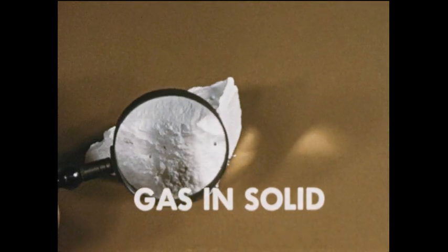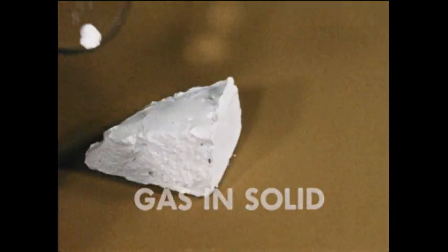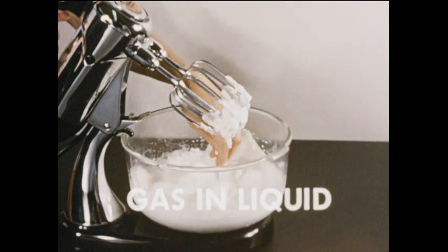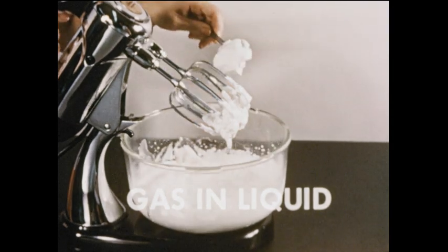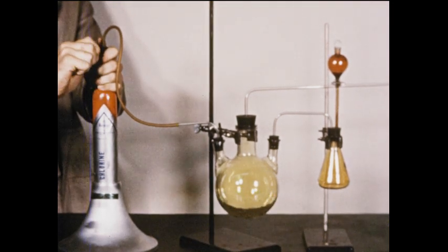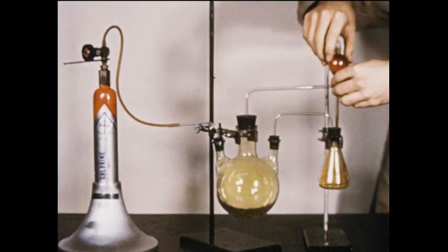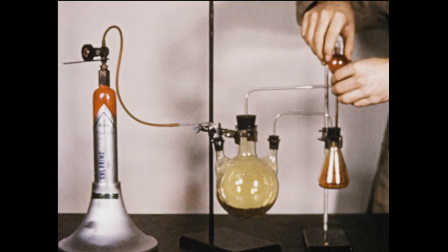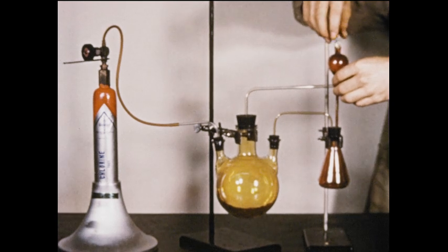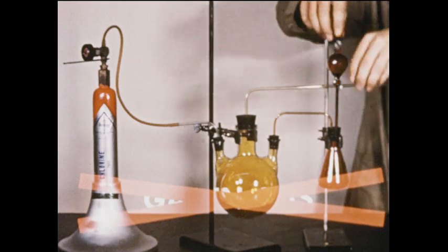Plaster of Paris is a gas, air, dispersed in a solid, calcium sulfate. When you whip cream, you're making a colloidal dispersion of a gas, air, in a liquid, cream. What about a gas dispersed in a gas? Here we're going to mix chlorine and bromine. In the mixing flask, the 2 gases are forming a dispersion. But we should remember that this is a mixture of molecular-sized particles, and that defines a solution, not a colloid.